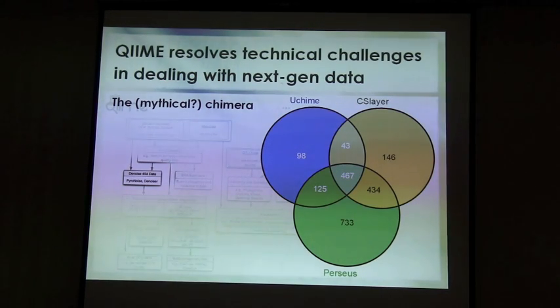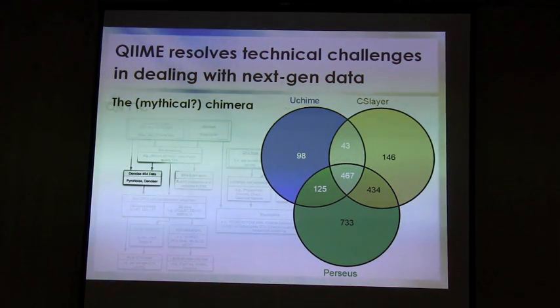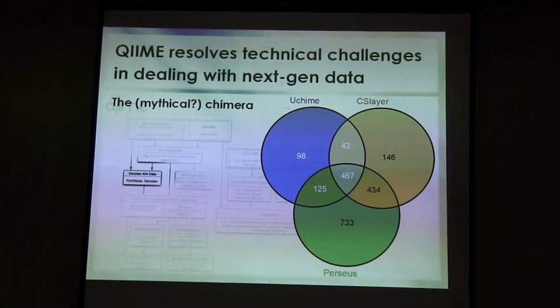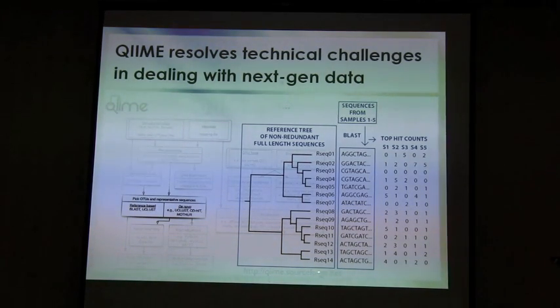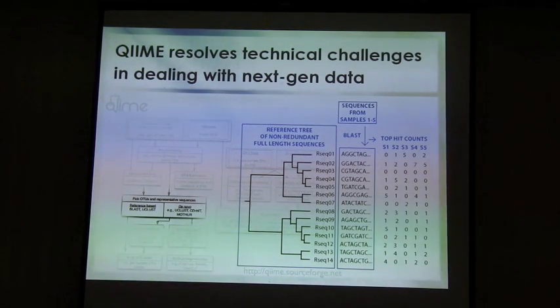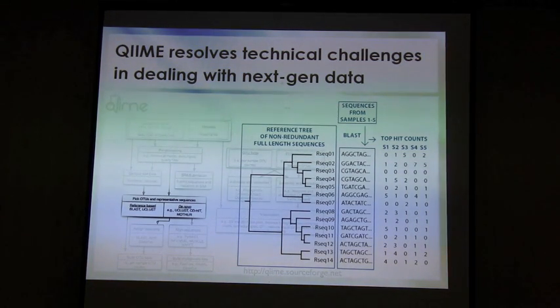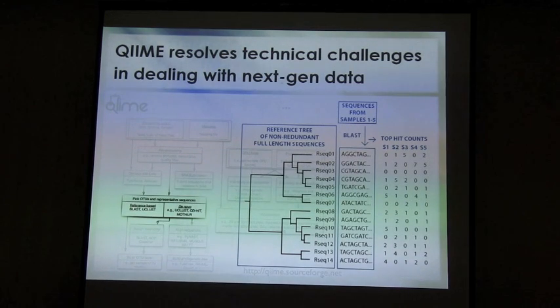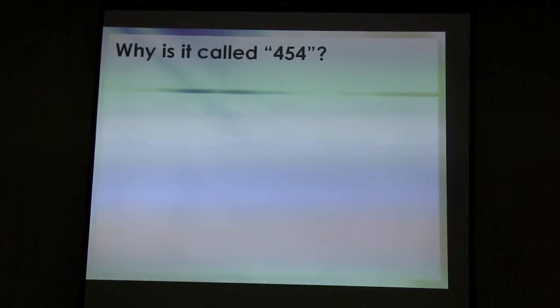So again, chimeras are very important for estimates of the number of species. They're less important for things like machine learning, where you care more about having a high count of sequences. Let's see, there's a bunch of OTU picking methods, including this really nice reference-based protocol that Greg put together, where basically the idea is to recruit to a reference tree and then pick de novo the additional clusters for just the sequences that you can't already get mapped into your reference OTU space, and so forth.